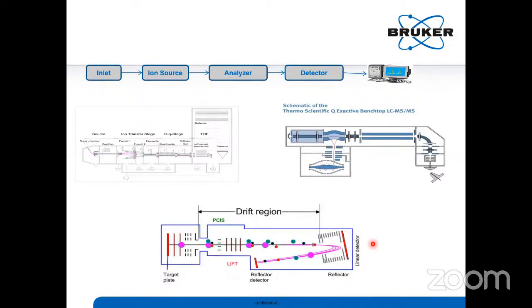For the same samples, if you want to analyze on HRMS with a gradient time of 20 or 30 minutes, 364 samples may take weeks. But the same thing with automation in MALDI TOF technology, 360 samples, you can analyze in less than 1 hour. And you need only 1 microliter of sample.